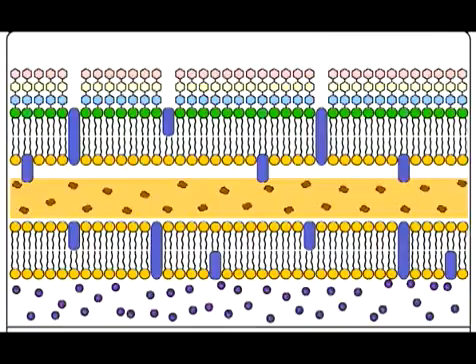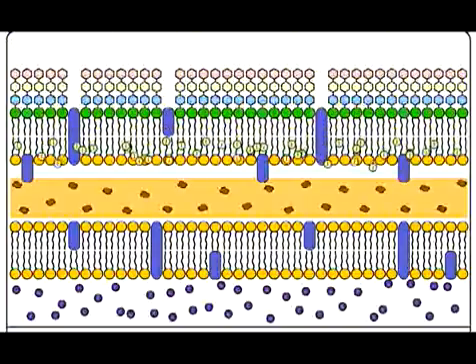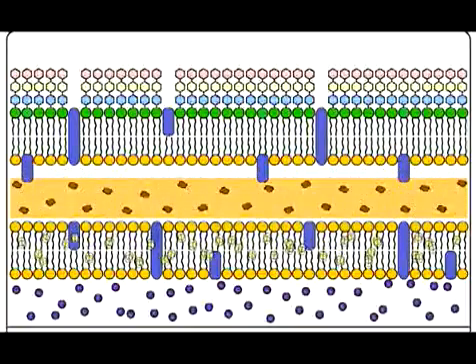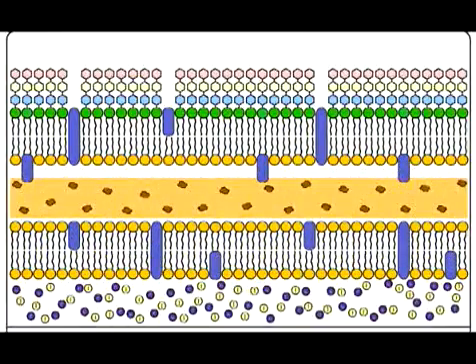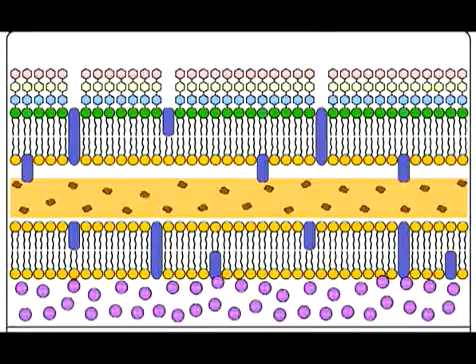Alright, now let's look at the addition of gram's iodine to a gram-negative bacteria. It's pretty much the same process. You can see the iodine molecules here, but this time they're going to have to move through that outer membrane first, through that thinner layer of peptidoglycan, through the phospholipid bilayer where again they'll meet those crystal violet particles, and again they'll form this larger crystal violet iodine complex.